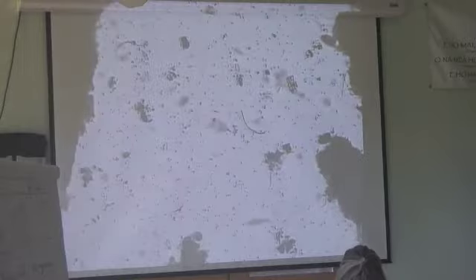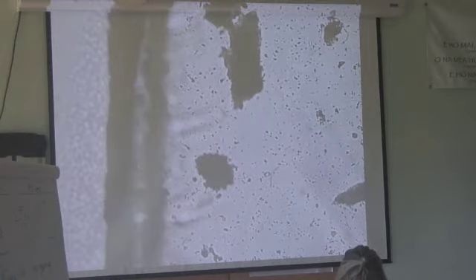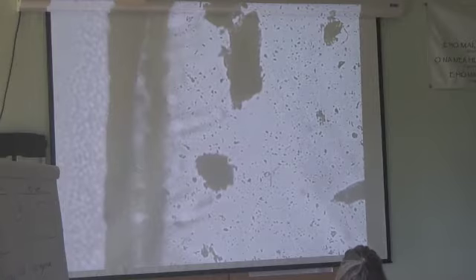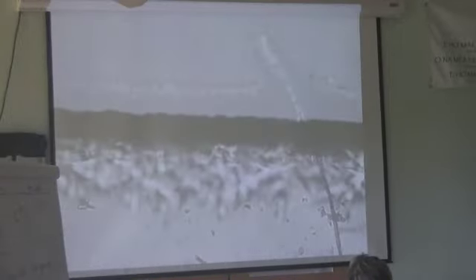So we're going to do our nematode count at the 4x objective lens. What's the total magnification that we're looking at here? 4. Because it's 4x objective but 10x eyepieces. So you always have to remember the eyepieces, so it's a total magnification of 40. So have some fun wandering through, taking a look at interesting things. Two nematodes in that sample.